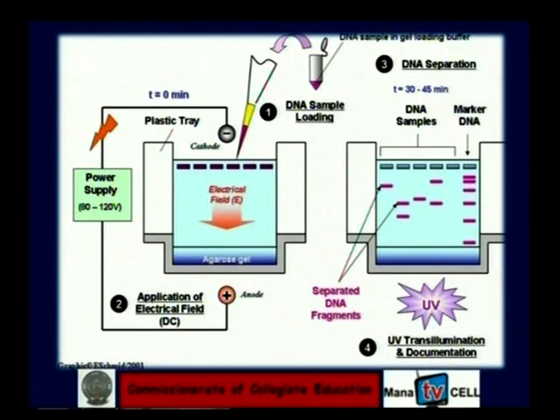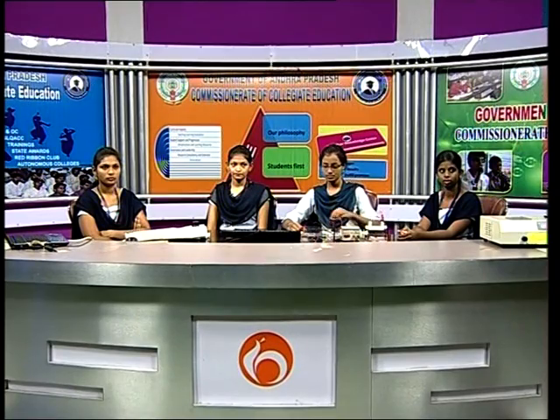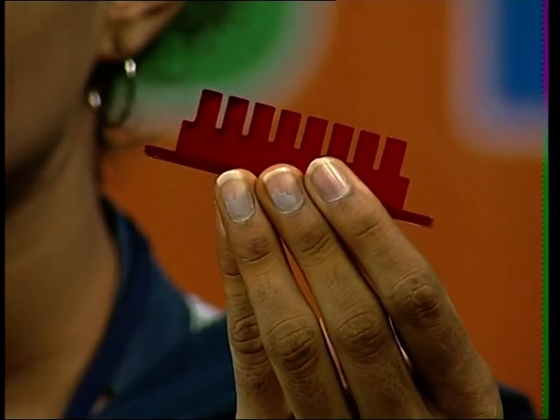And this is the diagrammatic representation of agarose gel electrophoresis. Before going into the instrumentation, I would like to explain the components of agarose gel electrophoresis. These are the boards which are used to cast the gel, and these are the combs which help us to provide the wells in the gel.